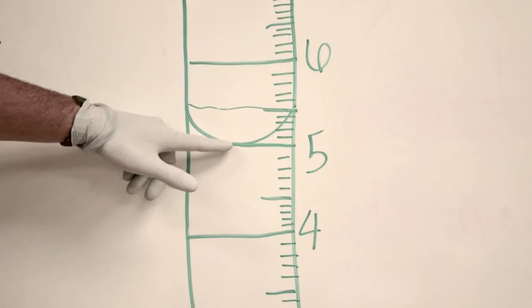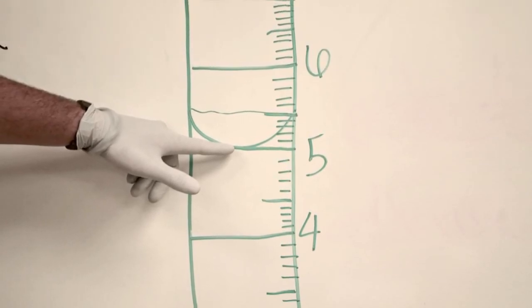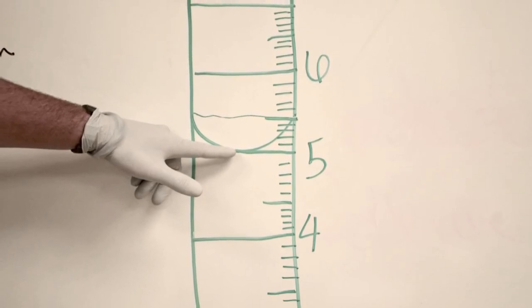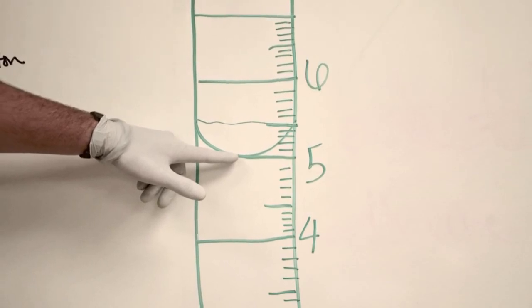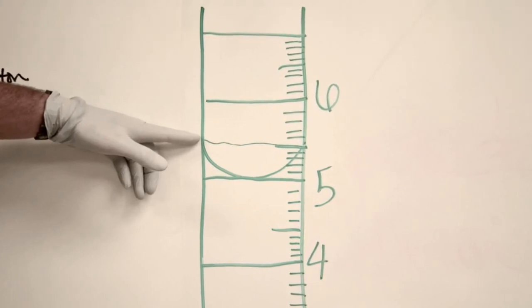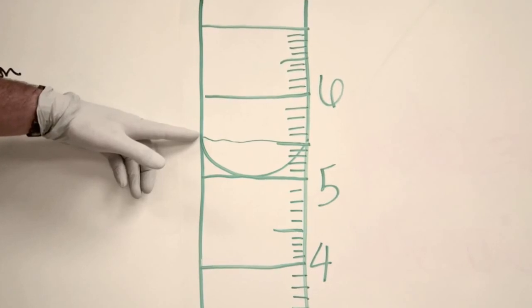When reading a pipette, you must remember to take into account the meniscus. The meniscus is the base of the concave in the liquid you will see. Now be sure to read the pipette at eye level. And as we can see, the correct reading for this liquid would be 5.0 milliliters. If the meniscus was forgotten to be taken into account, this liquid could easily be misread at 5.5 milliliters.